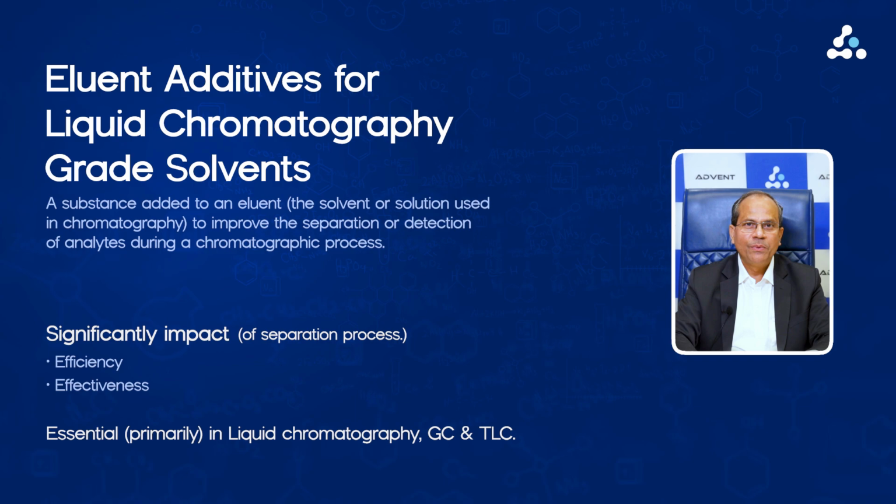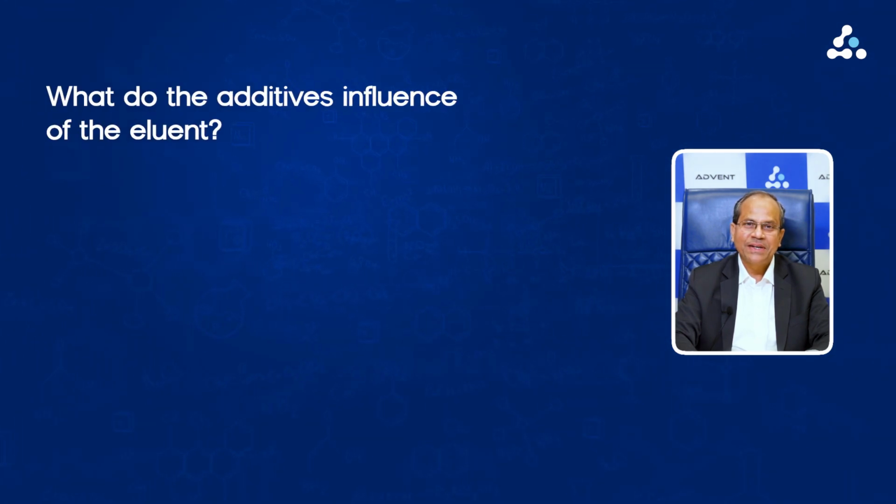But today we will be discussing eluent additives which are used in all types of liquid chromatography solvents, be it common HPLC, UHPLC, LCMS or ULCMS, etc. The next question is, what do these additives influence in the eluent? There are many factors these additives influence.